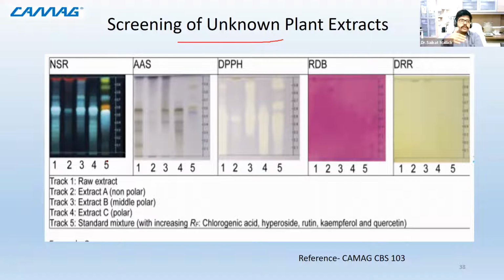Now here slowly we are moving into the bioautography part, and here you can see although the separation has happened, but due to diffusion, so this is what I was talking about. If we are not very well equipped with the dipping technique, this problem may arise and you may see a dragging effect. So make that dipping in one shot, just dip it and remove it, and you will see a good response out of it.